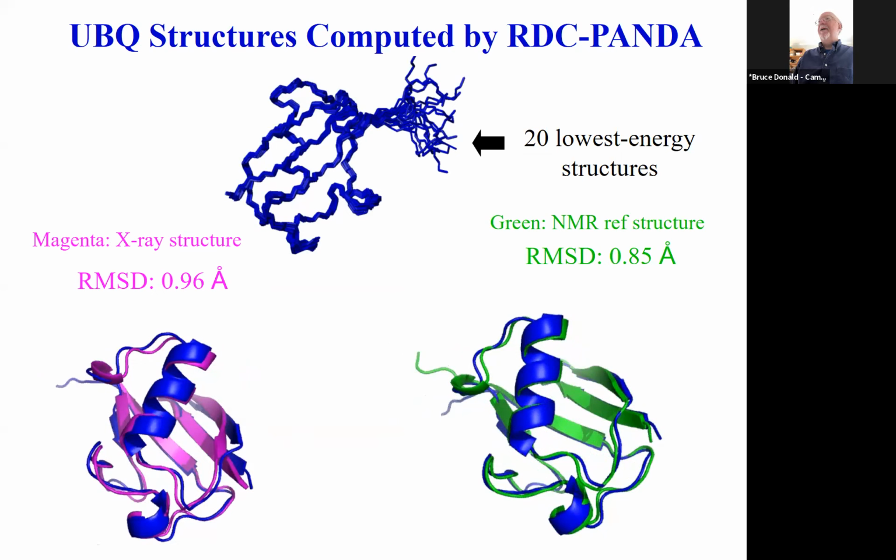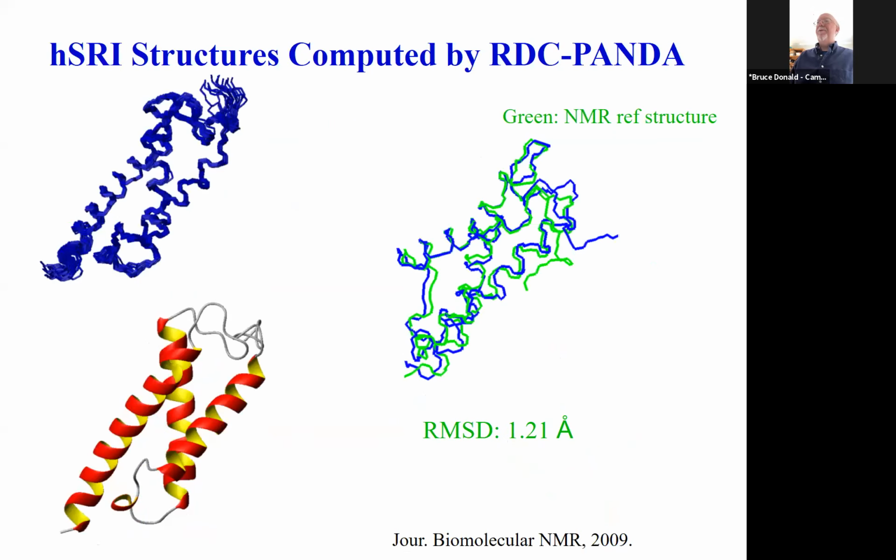But from a computer science or computational biology point of view, instead of it being a big heuristic stochastic optimization process by simulated annealing, we can understand the geometry well enough to say that the solution structures are something we can compute by exact solutions. And then we can use those exact solutions in some kind of discrete search in order to enumerate, if necessary, all the structures, but certainly the best structures.